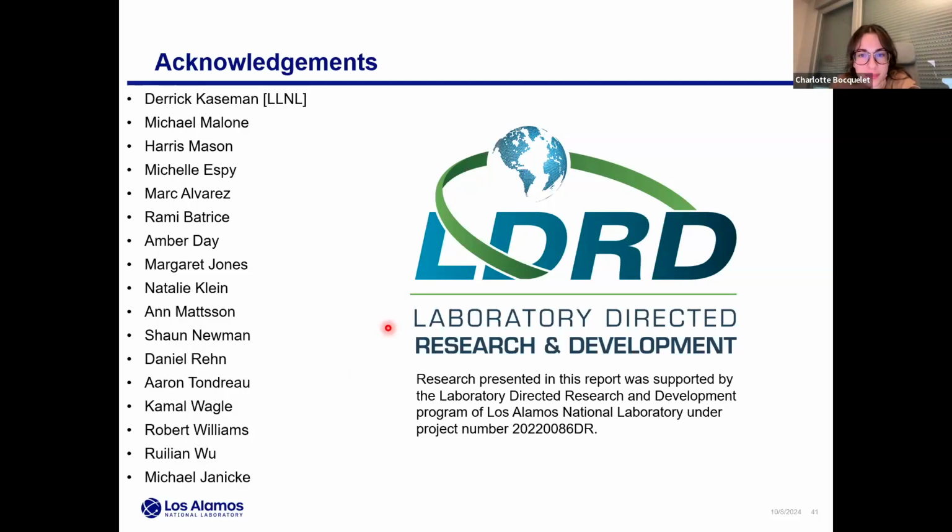From Benjamin. He said on slide 10, there was a 14N NQR simulation. He's asking, what software did you use to simulate the 14N NQR? Yeah, in that case, I was using Spinach, the MATLAB program developed by Ilya Kuprov. And I'll just note again that in the fast field cycling NMR, when I provide a simulation, that's actually doing Zeeman perturbed NQR simulations in Spinach as well.